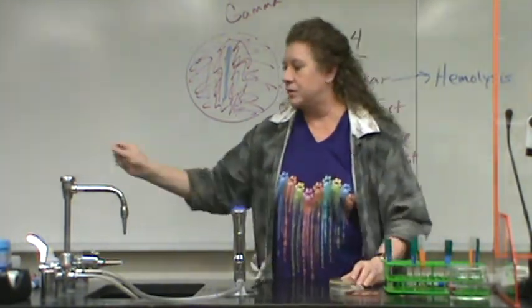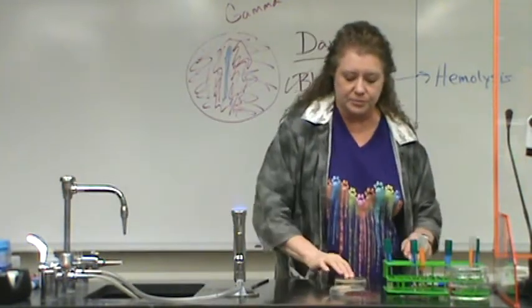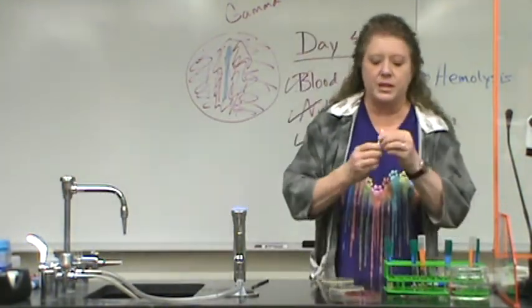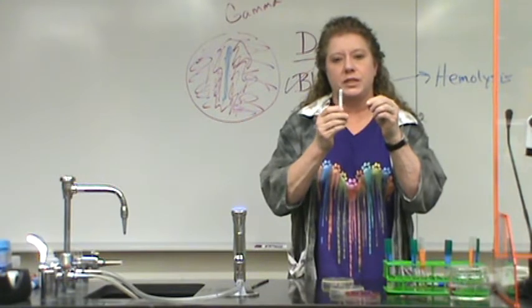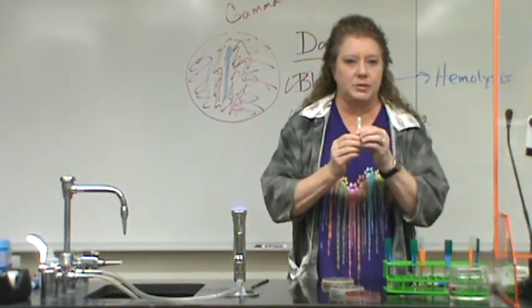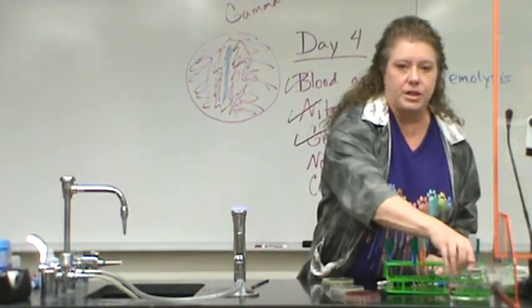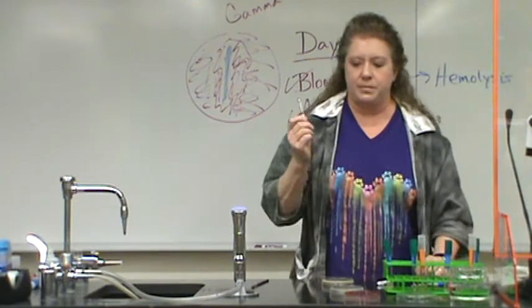Okay, make sure you discard the swab in the proper place. Okay, so these are the same cartridges you used last week, except this is novobiocin, so each of these filter discs has been soaked in novobiocin. Okay, remember you need to sterilize your forceps for this method.